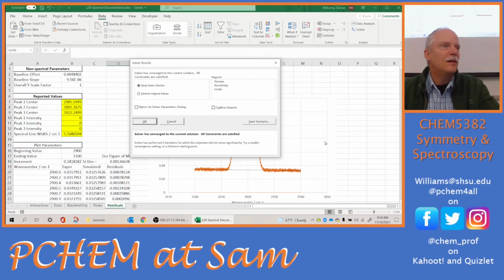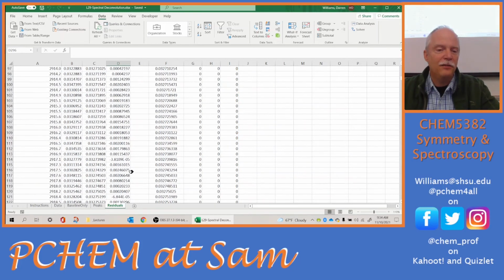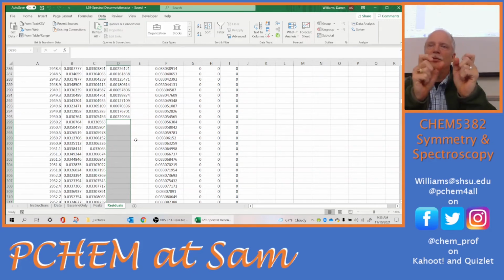How did you just tell it which residuals to use? I just deleted all the others. So I just went down here after 2950 and selected to the bottom and deleted them. Yeah, I used my hotkeys and just deleted those. Okay. So that's one way to do the baselining that may be useful for you as you're doing yours. You can pick the regions between your peaks or above and below your peaks.